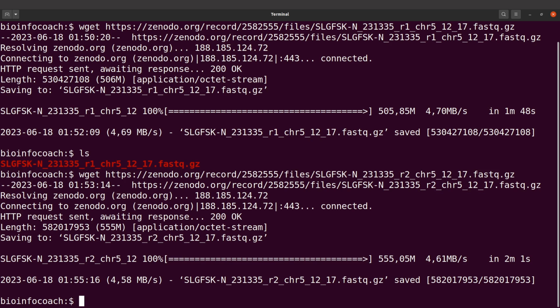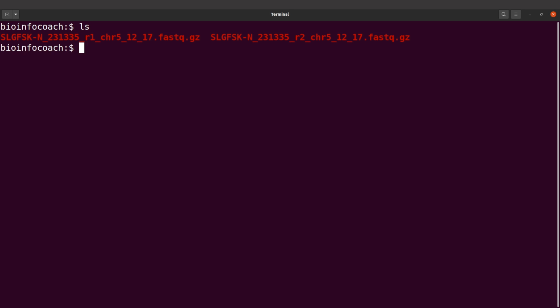All right, read two has also been downloaded. So let's take a look at it. Let's do an ls and we are going to find it's there. All right, so we have both files downloaded. Now let's also download the adapter.